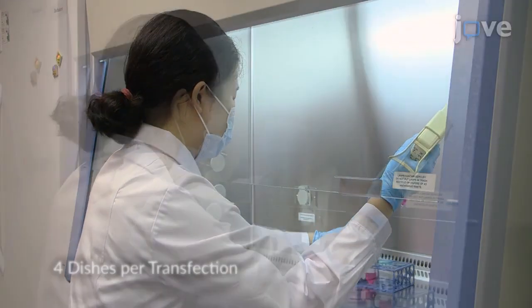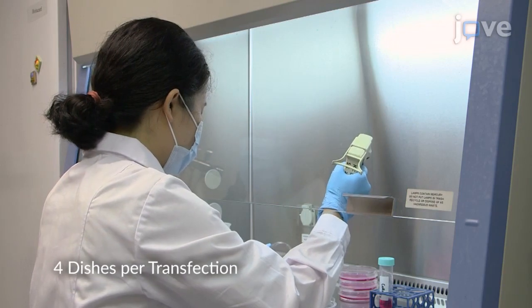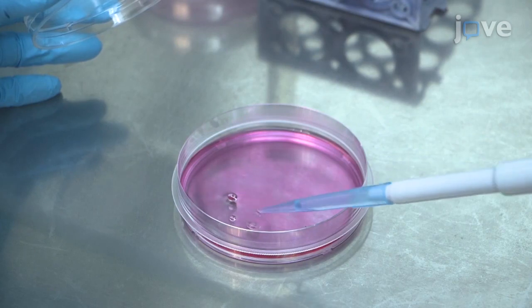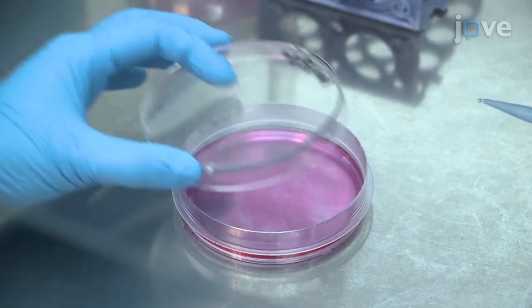To begin, plate 2 x 10⁶ cells in a 100 mm culture dish. On the next day, transfect the cells with lipofectamine according to the manufacturer's instructions.